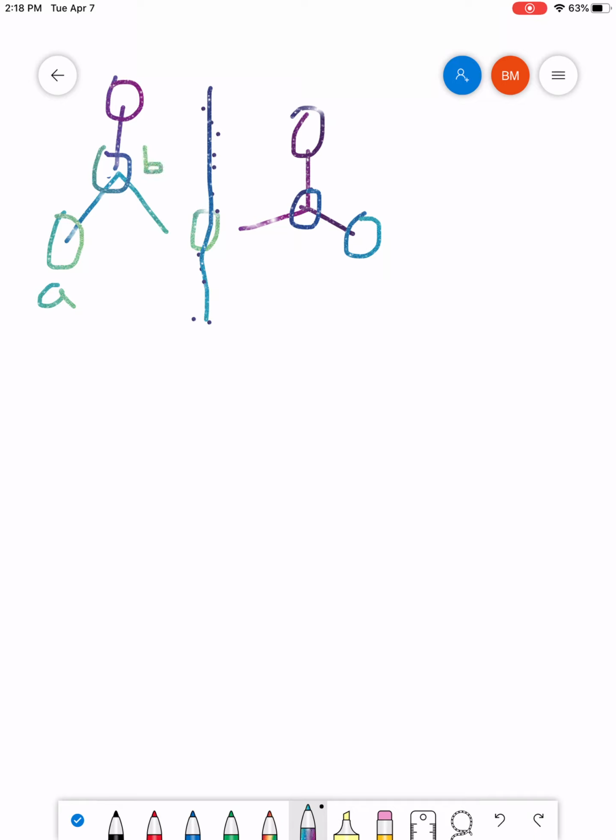These 2, A and B, are definitely unique from each other. Within this left side, I think you can also see that the H's on this methyl group are really no different than the H's on this one, right over here. Okay? So within this side here, you only have 2 signals.